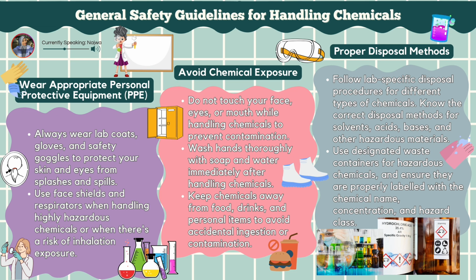Secondly, avoid chemical exposure. Do not touch your face, eyes, or mouth while handling chemicals to prevent contamination. Then, wash hands thoroughly with soap and water immediately after handling chemicals. Keep chemicals away from food, drinks, and personal items to avoid accidental ingestion or contamination.